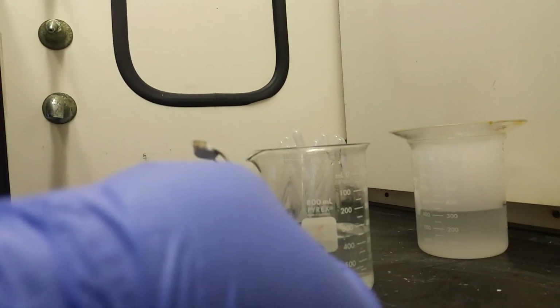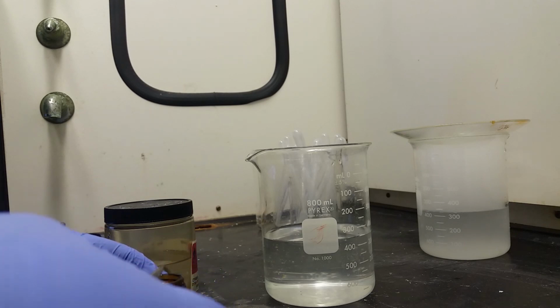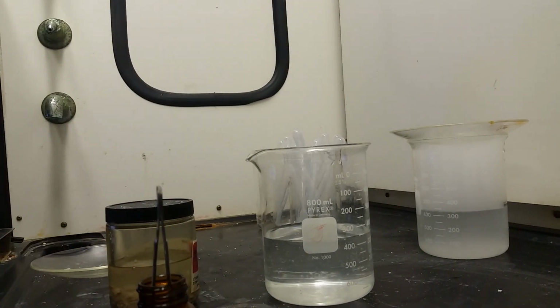And then we're going to see the same reaction. You see it's similar, but just a little bit different. And we see a very similar reaction with it. Again, it's covered with oil, so that will delay the reaction just briefly. So we're going to see the same chemical exchange in a single replacement, and we will see the release of energy. I'll try and rotate this one so that you can see it once we find out where it is. Okay.